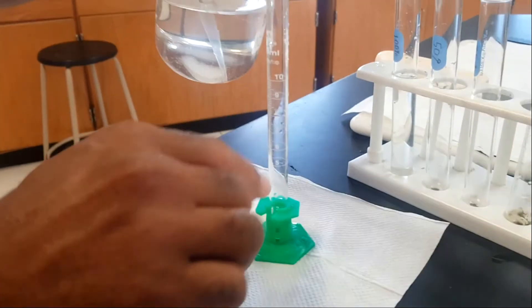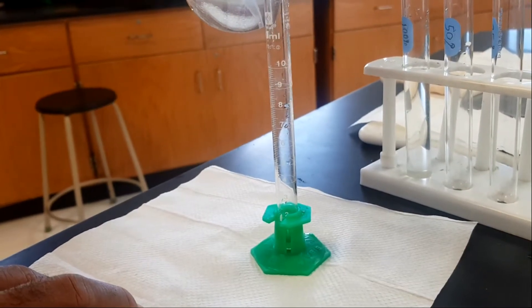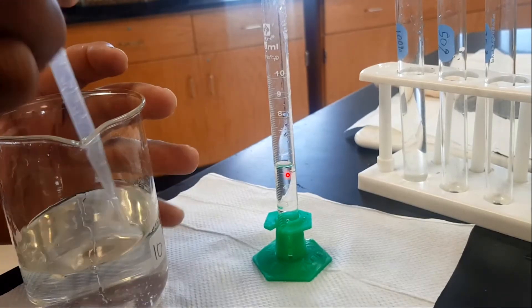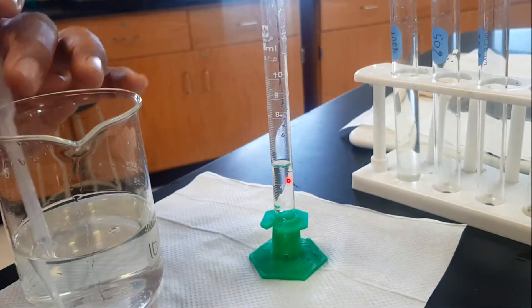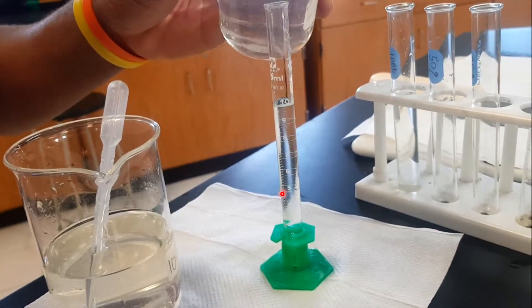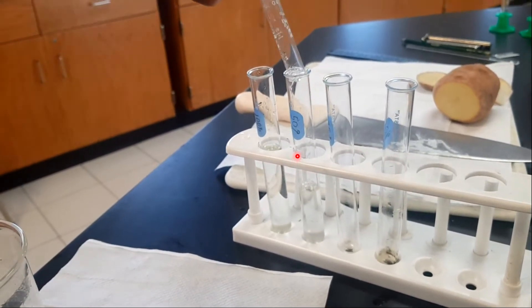Your next step is to measure out the different levels of concentration of the sugar solution. The first one I'm going to measure is a 50% concentration. I'm going to put in 5 ml first — you can use the dropper if you have excess to bring it back down. Stay at eye level to measure. Once you have the 5 ml, pour 5 more ml of distilled water to bring it up to 10 ml — that's a 50% concentrated sugar solution.